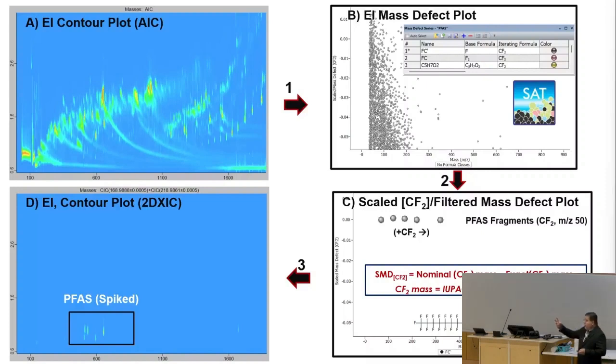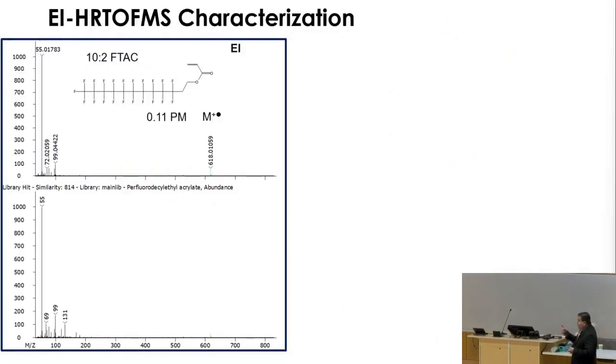So those first three steps occur, again, just to locate those trace components in the sample. You still have to characterize it, right? And that's where the mass spec data comes in. More specifically, the high-resolution mass spec data. And you can have a molecular ion. It's still a skinny spectrum. I trust this one, and it looks like I didn't get my spectral similarity value, but if you squint very hard, you can see that it's above 800. But more importantly, I also have mass accuracy for that molecular ion. Just happen to have one in that case.